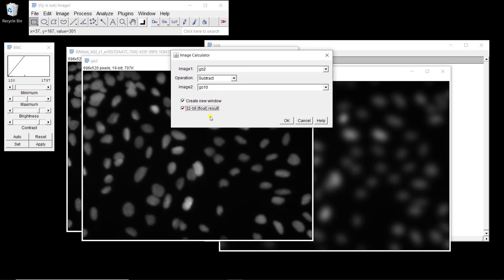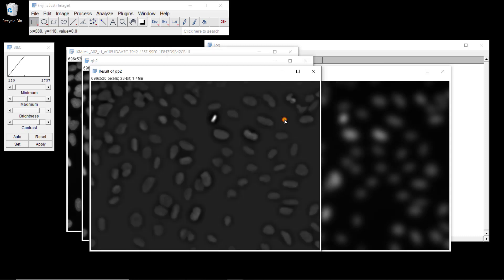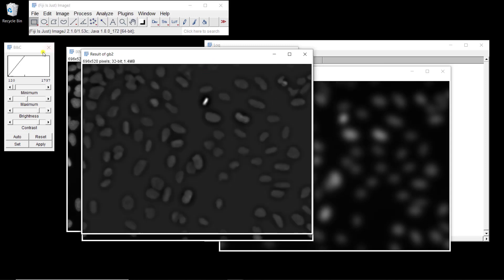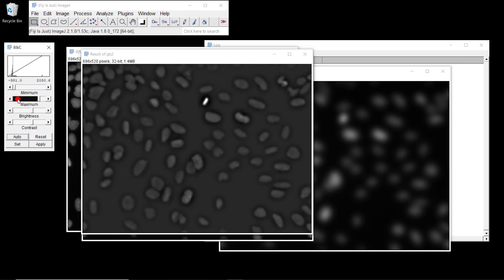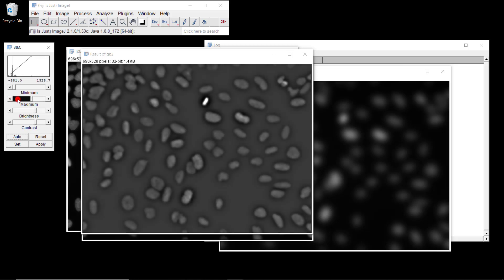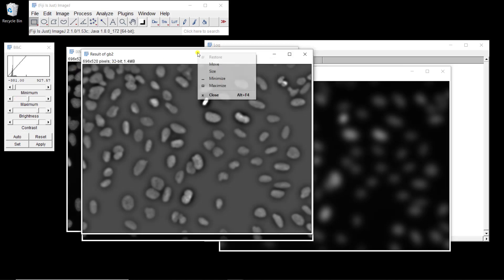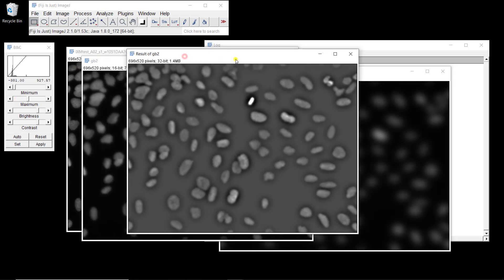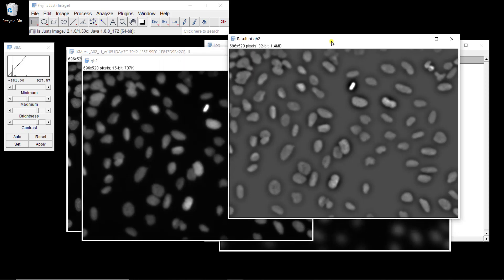This is the result. Maybe different filter sizes would have been more appropriate, but this works. When you look at this, it might be easier to threshold this image than to threshold the original image.